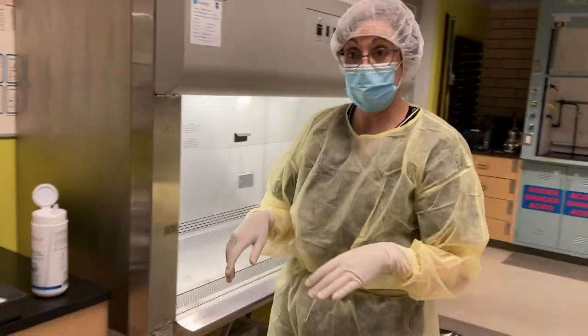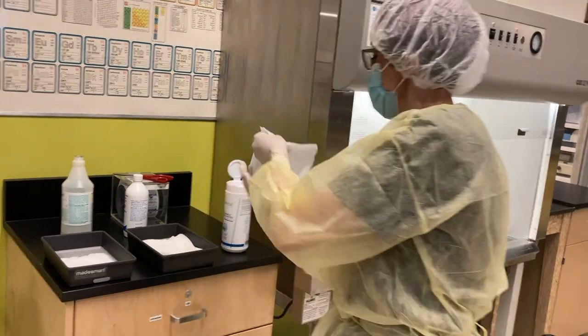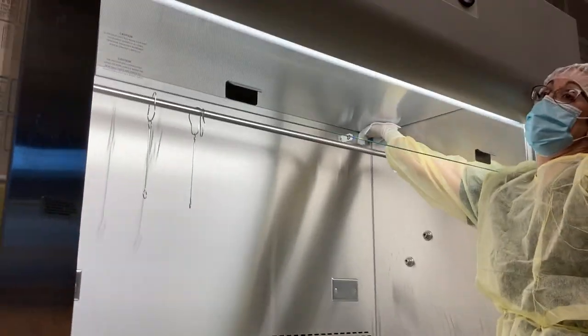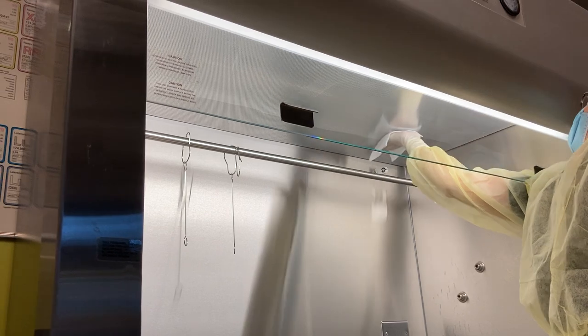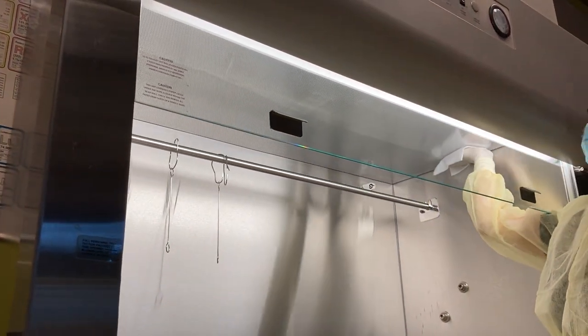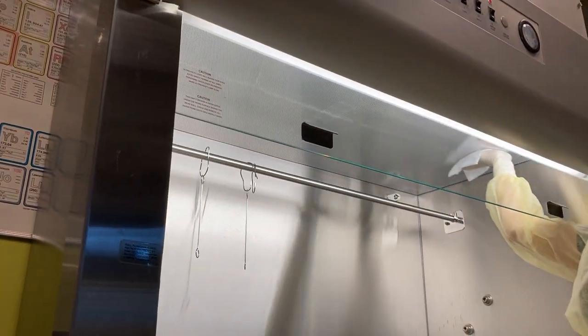Now we're going to repeat this whole procedure using our sterile alcohol. So starting on the ceiling, we're going to do method A, side to side, back to front, slightly overlapping. And this is disinfecting the primary engineering control.